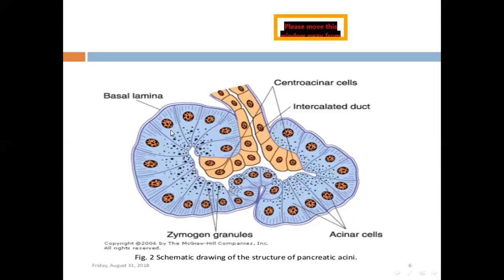These three to four cells are the beginning of the ductal part. Now let's go part by part. First, the acinar cells are pyramidal in shape, as we see, and are based on a basal lamina.